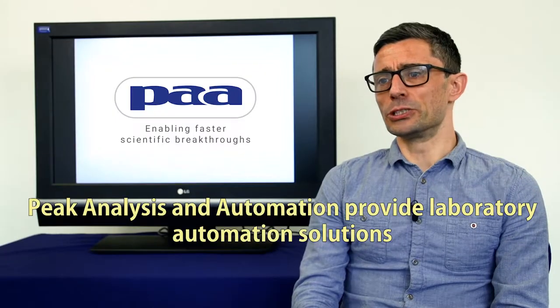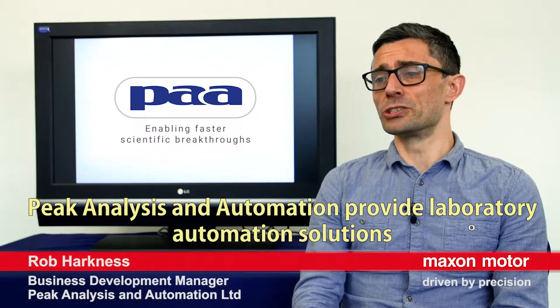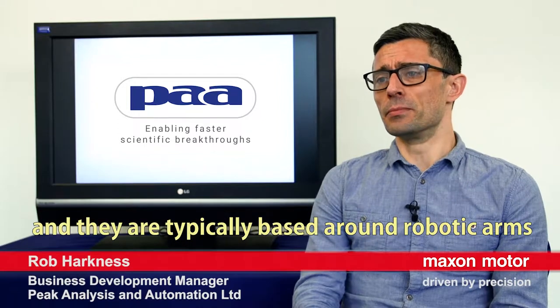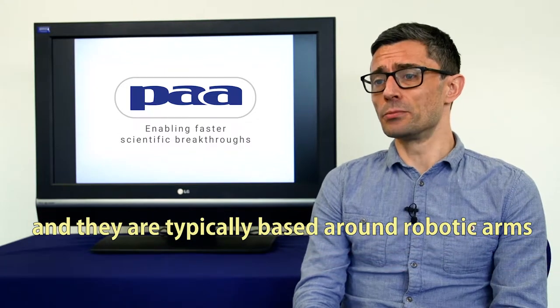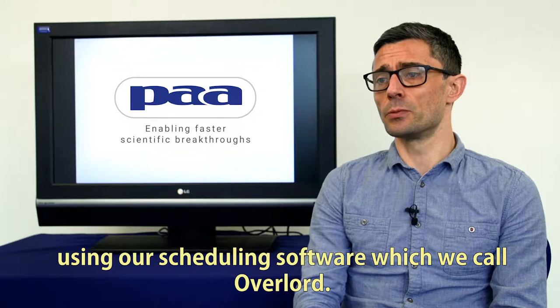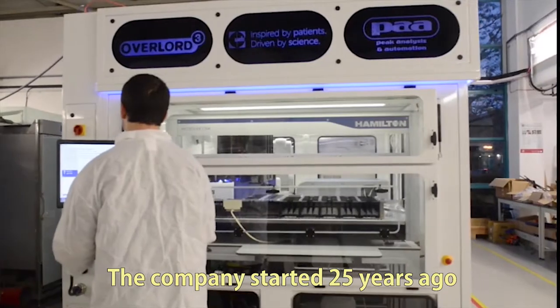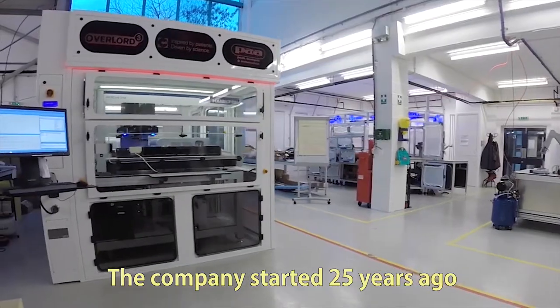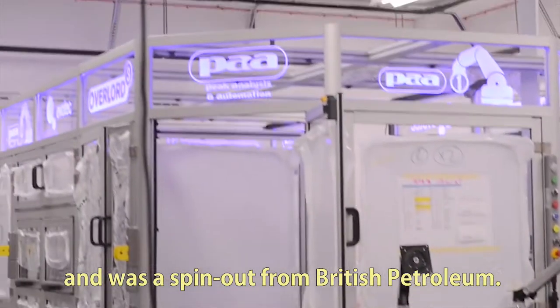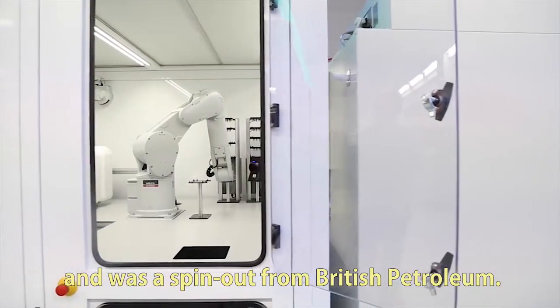Peak Analysis and Automation provides laboratory automation solutions. These are typically based around robotic arms using our scheduling software, which we call Overlord. The company started 25 years ago as a spin-out from British Petroleum.